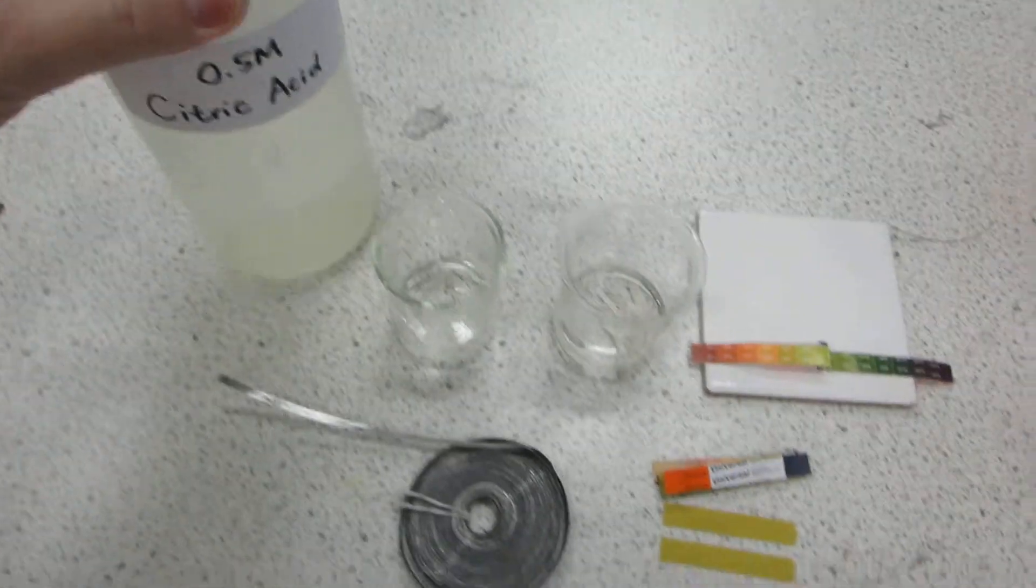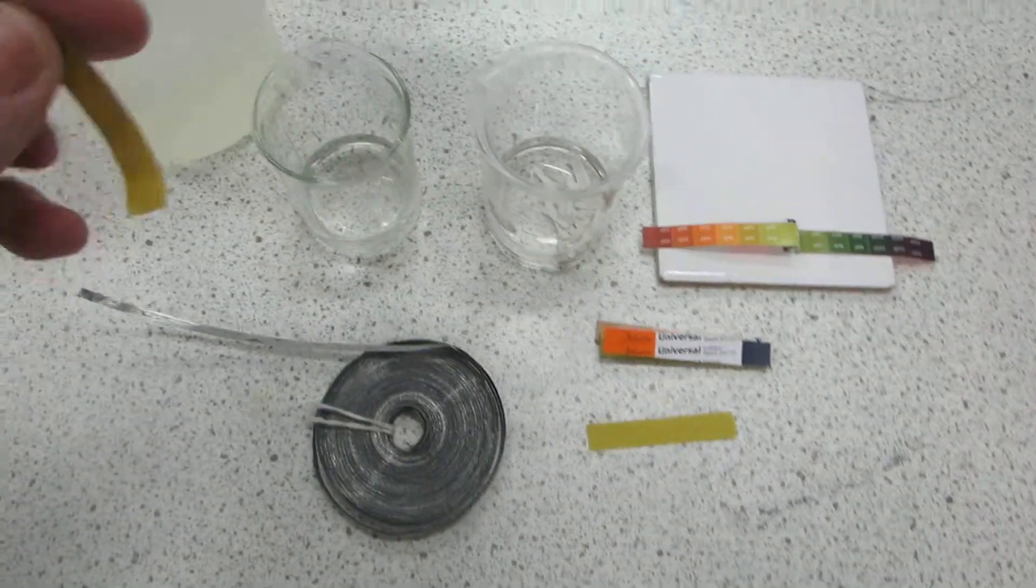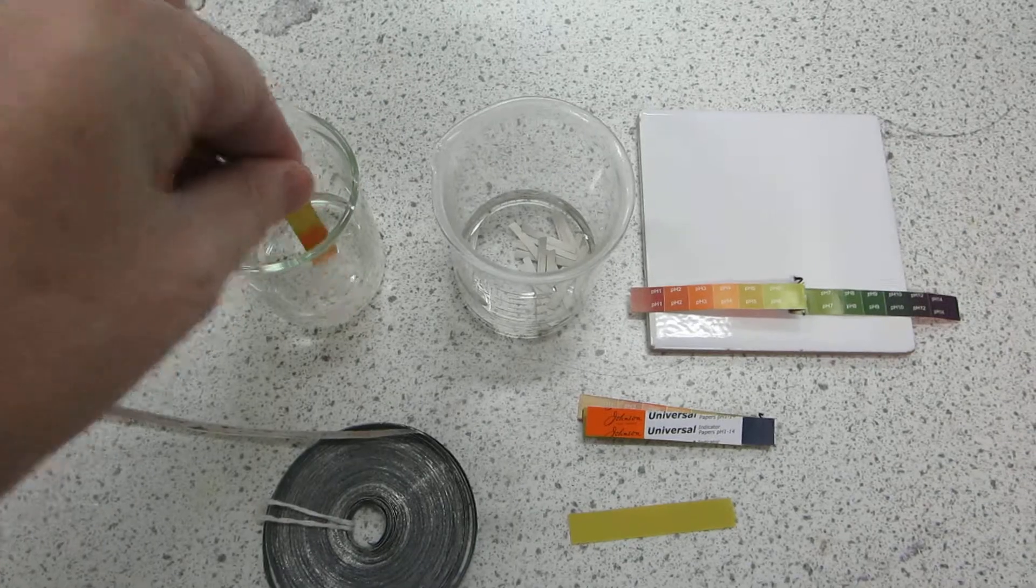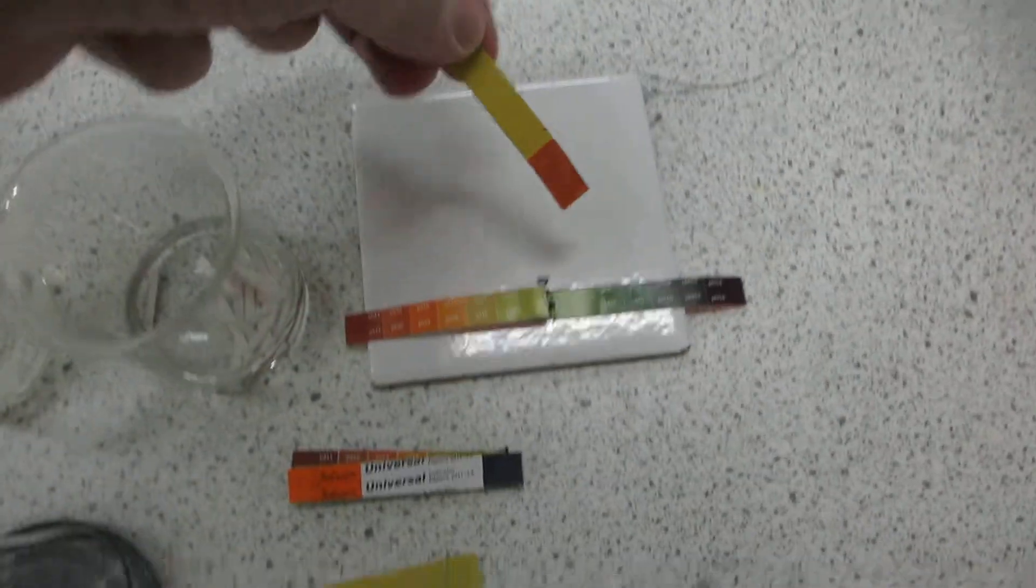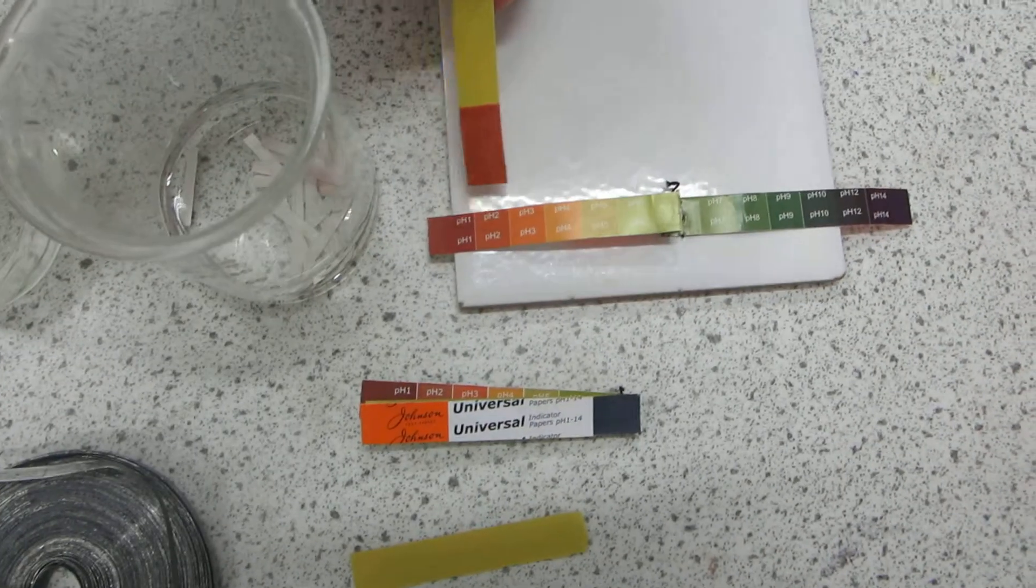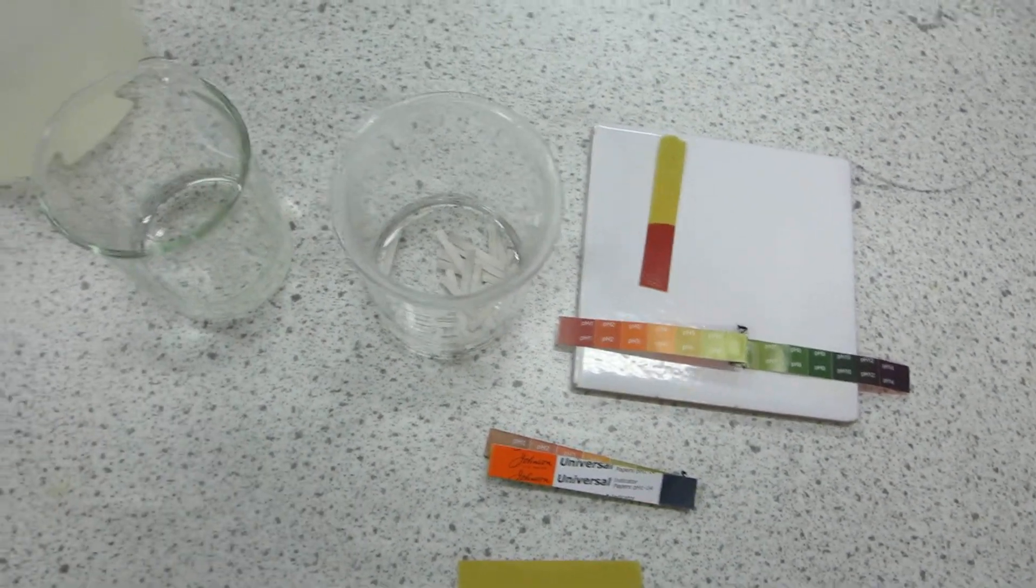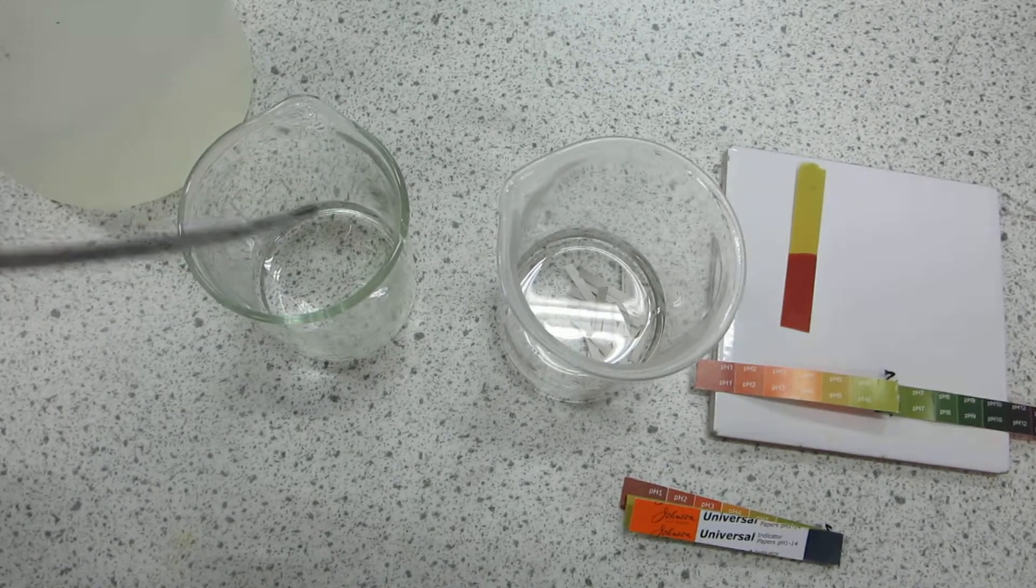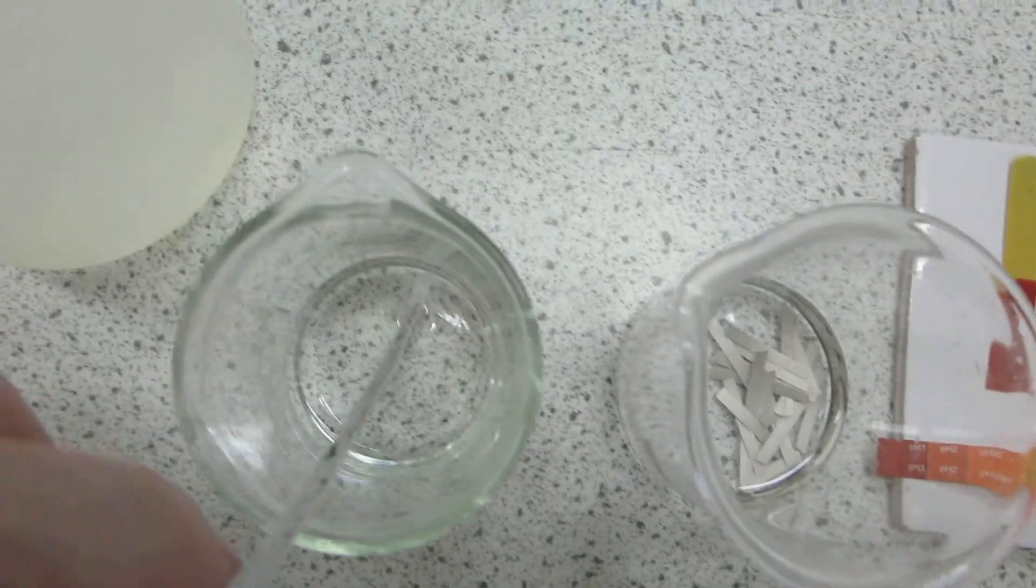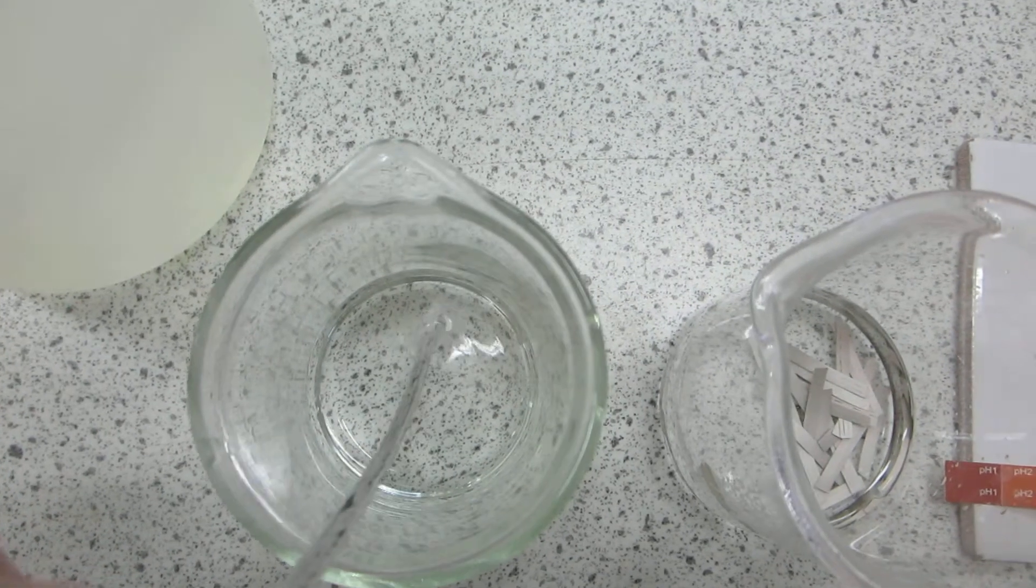Citric acid, 0.5 molar. If we measure the pH with this universal indicator, we see we get a pH of one to two. If we add magnesium to the citric acid, we can see a rapid, vigorous reaction.